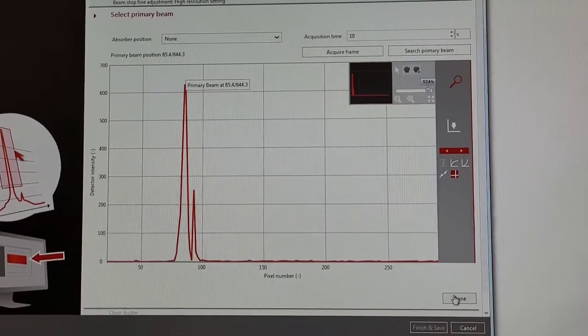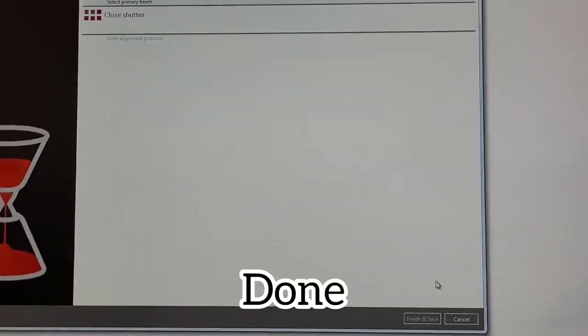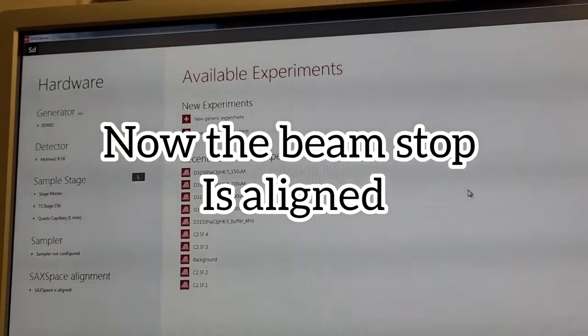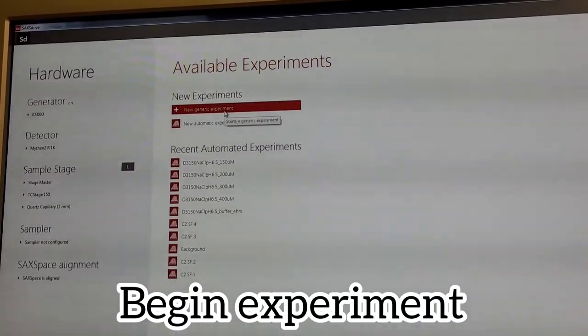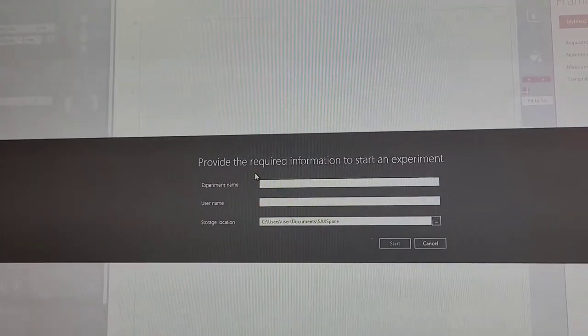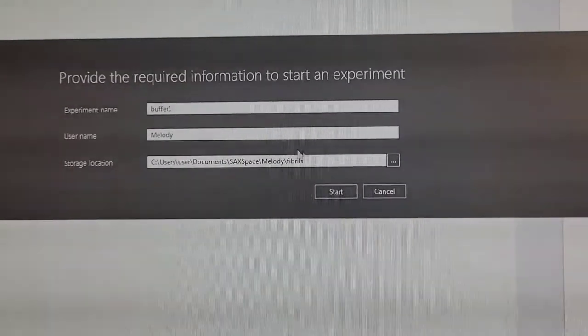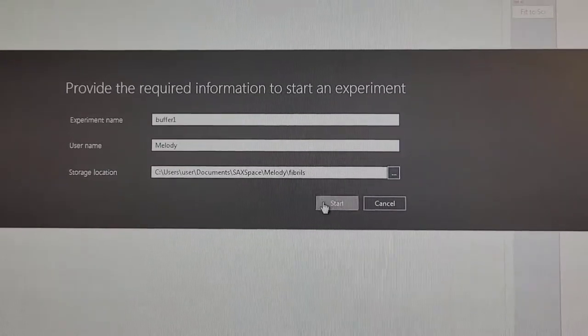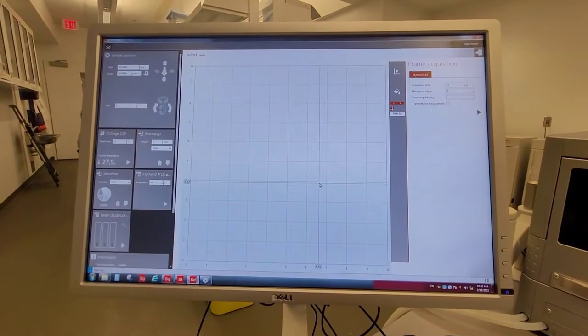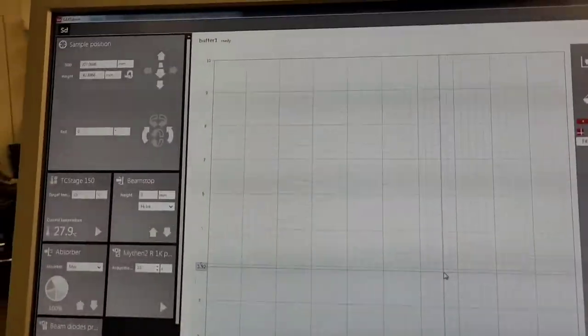Every time you do an alignment it is good for 2 days. You can do a lot of measurements in that time. But after 2 days it's not really reliable and you should do another alignment again. Now I can finally tell the software where I want to save my file and what it will be called.